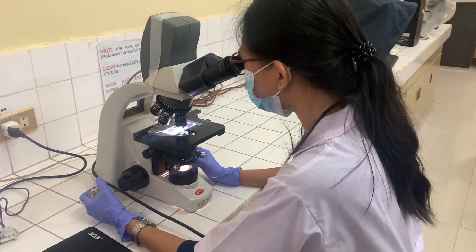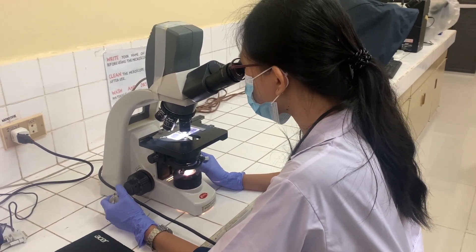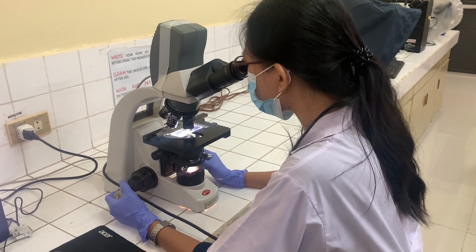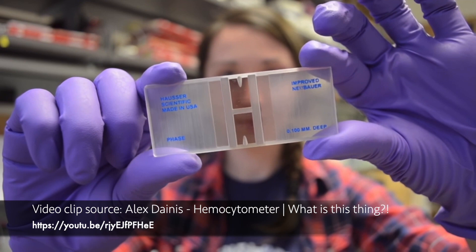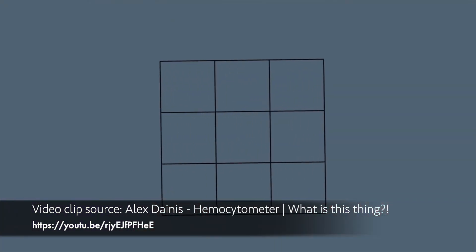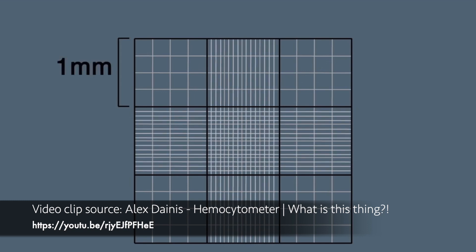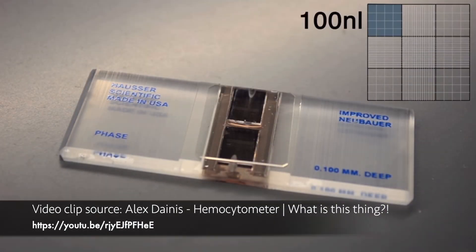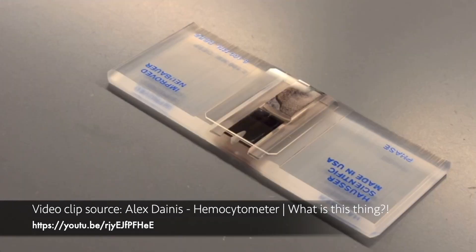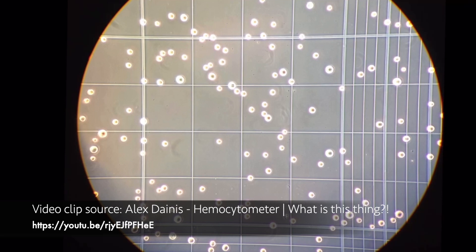Once you have examined the cells, count them and compute the total hemocyte count expressed as cells per mL of hemolymph. The hemocytometer is a thick microscope slide with two counting chambers. Each chamber is divided into nine main squares that are 1 mm by 1 mm. When a coverslip is placed on top, each square contains 100 nL of liquid. Look at the grid and count the number of cells in a square.